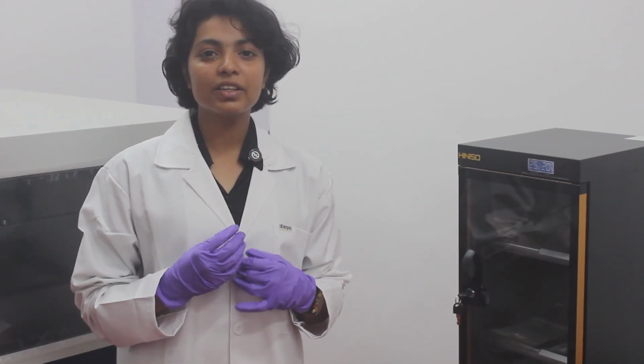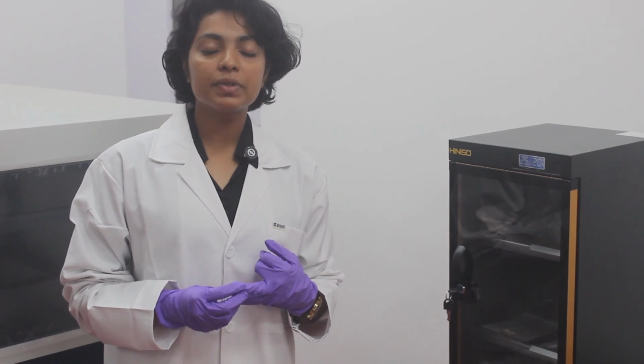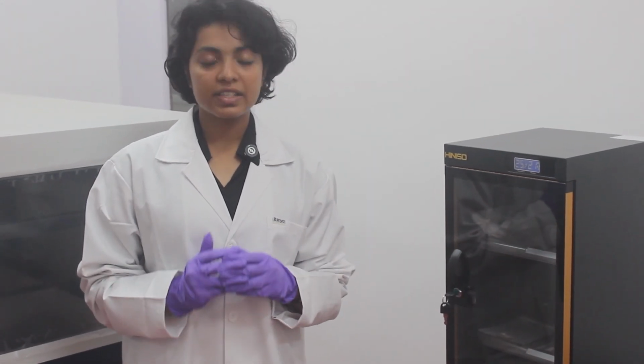The samples that we generally use for analysis are solid samples, powdered samples, and thin films. Here in our XRF machine, we are not able to use liquid samples. So there are some usage limitations for our XRF machine.